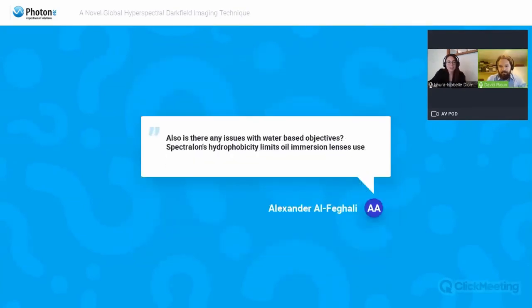Thank you, David. So let me publish another question, also from Alexander. Is there any issue with water-based objective? I don't know, David, if you're familiar with water-based objective, if you can help answer this question. I'm not, personally. I haven't really used the water-based objectives, but it works with air objectives. It works with oil immersion objectives. So basically, it's just a different medium. In my opinion, it should not cause any problem. But I do not have a lot of experience working with that.